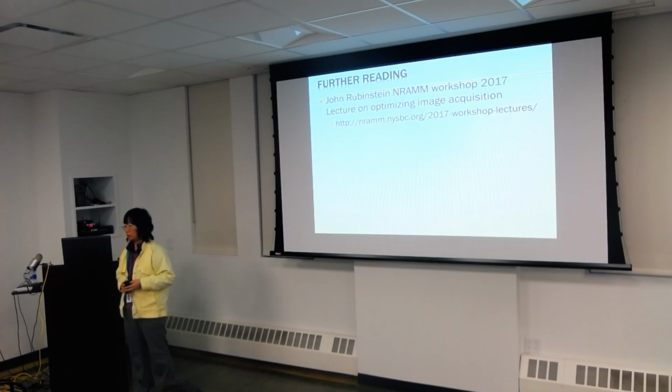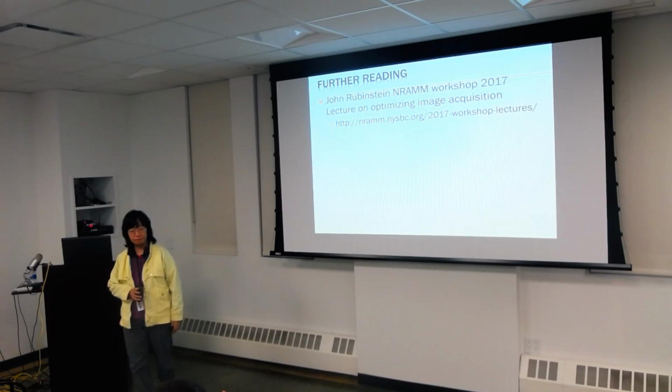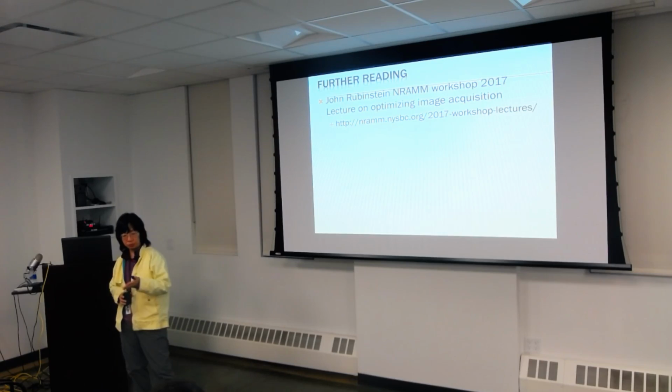So that would be plus and minus, right? With the other one, you can just keep going to make up for the lack of good information in one image. With the phase plate, you can also push towards smaller particles, right? Yes, you've been able to push into smaller particles. A lot of people have shown that they can do the same thing just by giving it higher defocus. If you can describe your CTF function properly at a high defocus, you can fit it properly, then there's no reason you couldn't do it. The only minus on that is the envelope.